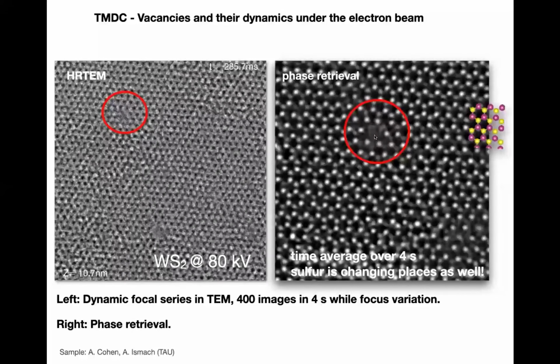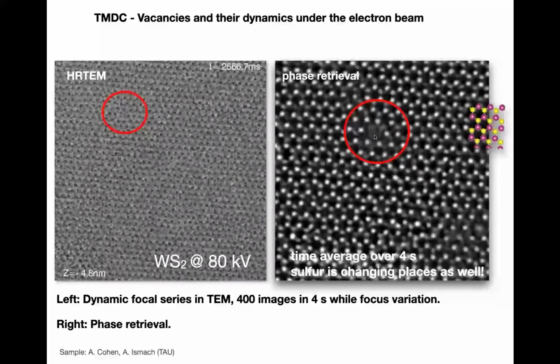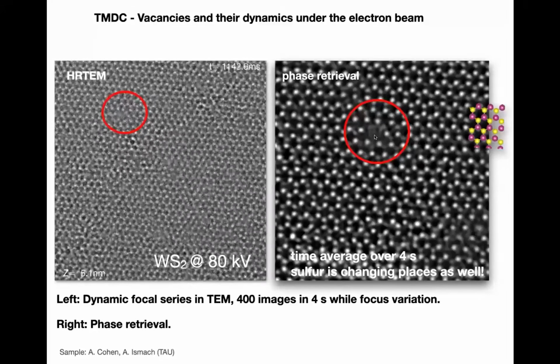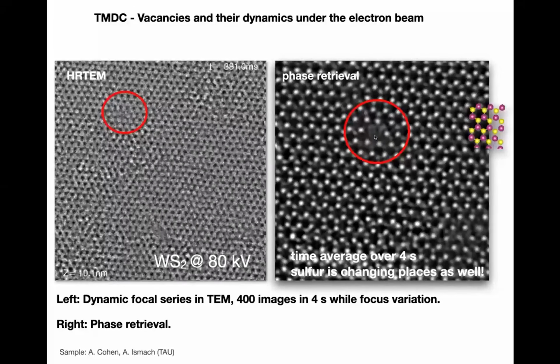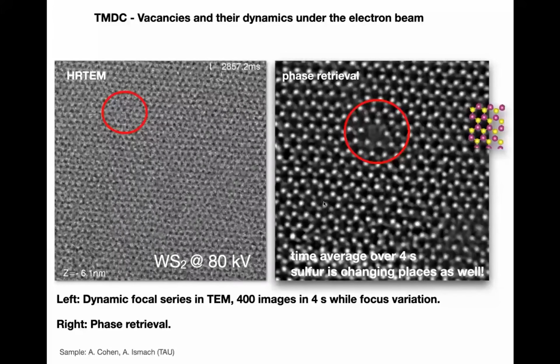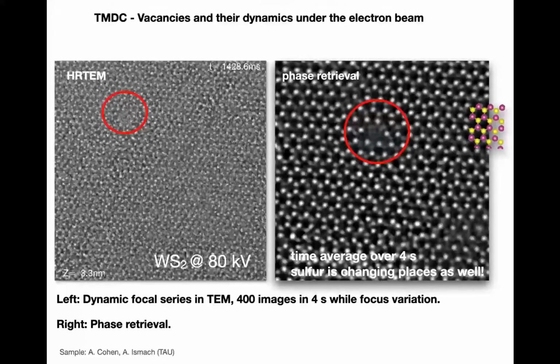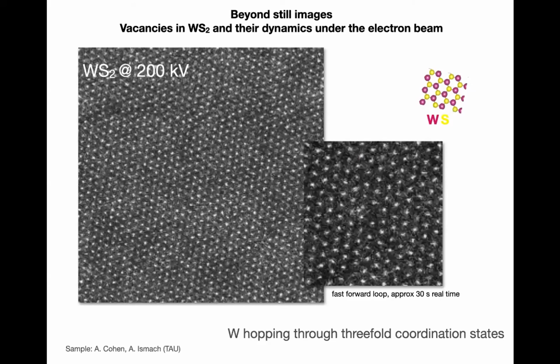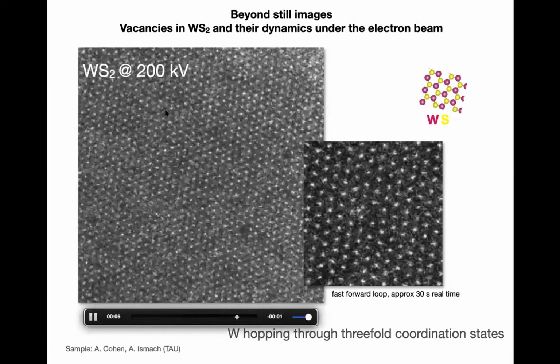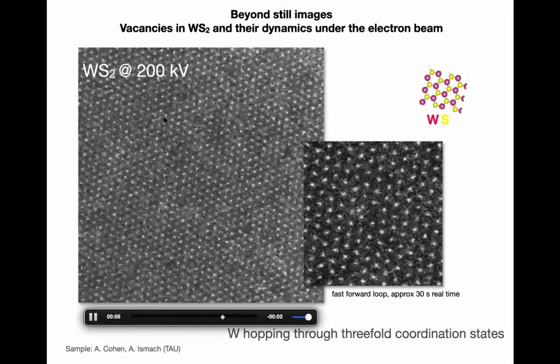We see that there is background intensity, and this is because of the sulfur, but the sulfur is not really bonded into fixed positions. That means in the defect, actually, during this 4-second exposure time, the sulfur also changed positions, and it's not attached into one bonding configuration, but it also flips between the different configurations. And there is also one more detail, which is quite curious, and that is actually that in many cases, the tungsten atoms are not really gone. So if you look at the animation here, then this is one of these defects, but the tungsten atom is still there, but it's just weakly bonded, and it has a much higher Debye-Waller factor, so therefore you hardly see it.